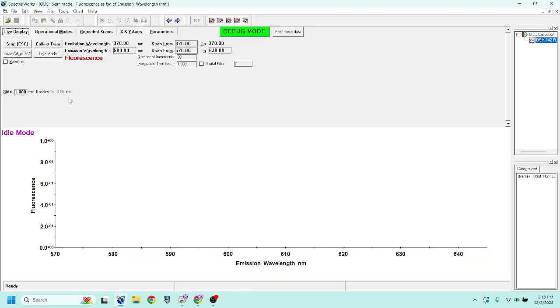In the 45 and the 245 fluorimeters, there are manual slits on the excitation side. For all these instruments on the emission side, it has manual slits where you can increase or decrease the slit width depending on the bandpass you need for your compound that you're measuring. So I'm now set up to collect my data, and then I will go ahead and just simply proceed with collecting data.